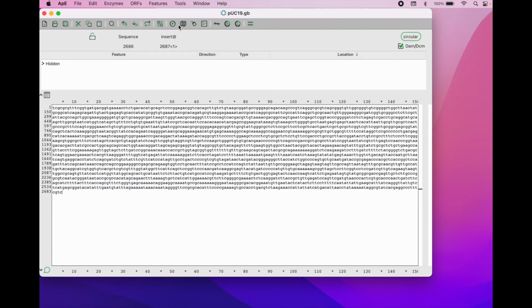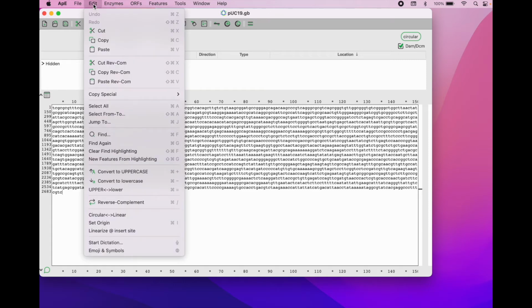I can click on many different things, but maybe we'll just do some high-level intro to this. I'm on a Mac, might be slightly different from a Windows machine, but you see a lot of the same thing. You can copy and paste things. We have things like reverse complement. So sometimes when you get a DNA sequence, it's in the wrong direction, right? So right now we're seeing the 5 to 3 prime in a particular direction. We might want to look at the sequence in the opposite 5 to 3 prime direction. And so you might use the reverse complement feature here.